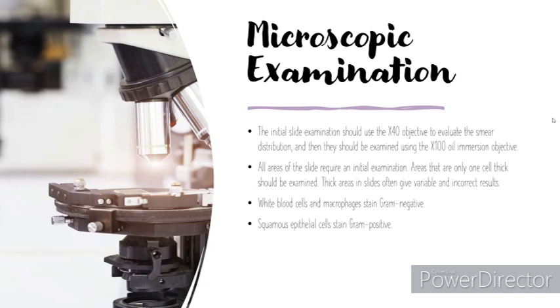So, like I just showed in the demonstration video, the microscopic examination should be used at the 40x to evaluate the smear. I used 50x. The microscope I was using didn't really have a clear field of view when I was on the 40x, so I thought it would be a little bit better to show you guys through the demonstration at 50x, even though it was an oil immersion lens as well as the 100x.